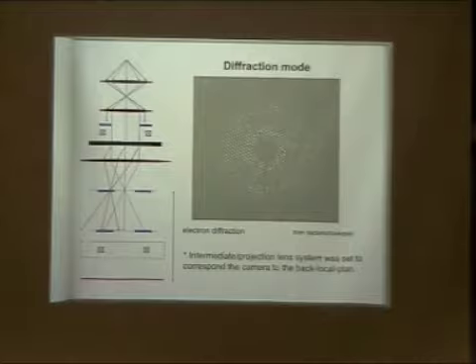Now you also have to think about how this is different from X-ray diffraction. In X-ray diffraction, you simply put your detector in this position. In the EM, your detector is behind this whole bunch of lenses. The beam goes through all of this, and what you see here has already been through these lenses. This is also why the aperture plays a role here, even though it's behind the back focal plane where the diffraction was generated. So this is basically how, in an electron microscope, when you push that button, you can record the electron diffraction.